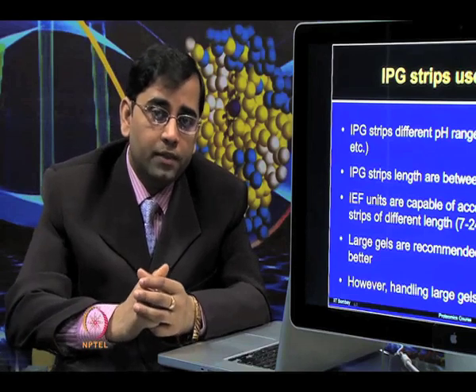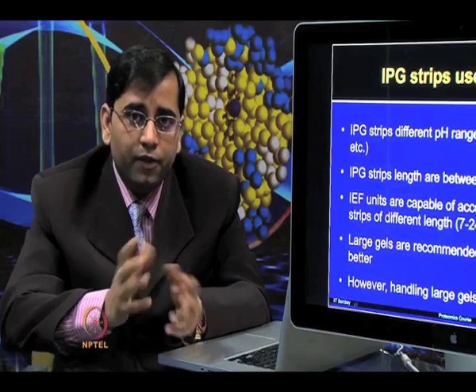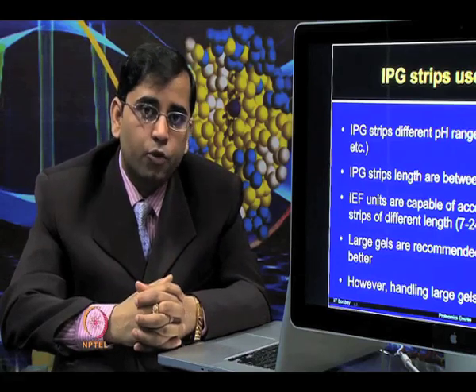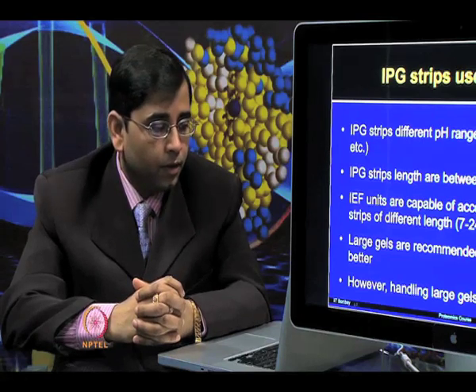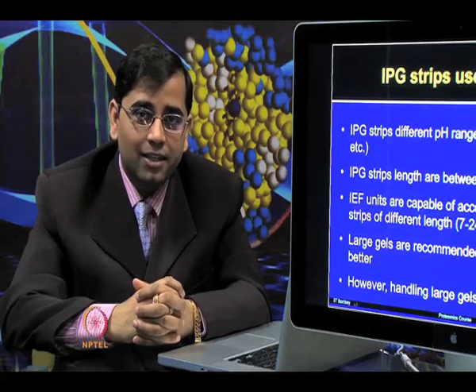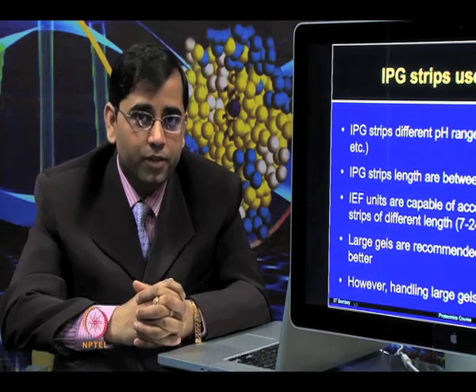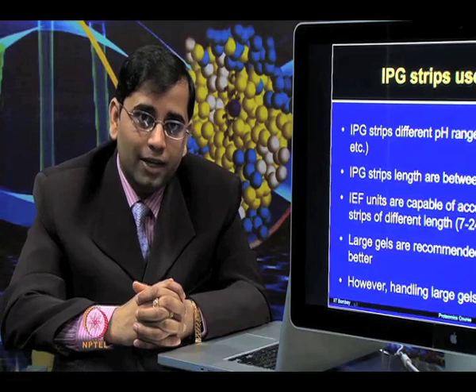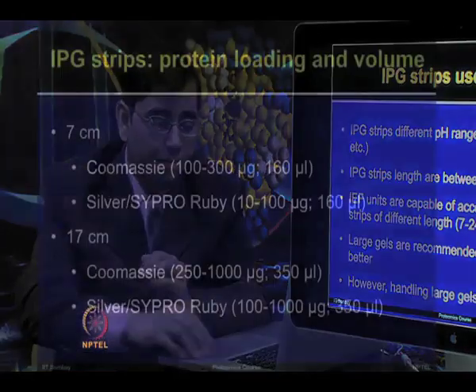But overall, the large gels are recommended for doing any type of differential proteomic analysis when you want to compare your controls and treatment spot. But handling the large gel is very tedious. So, I will show you some lab demonstration, the video for that, so that you can be well prepared to perform these experiments in your lab.